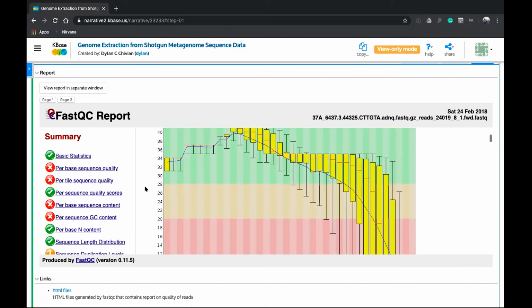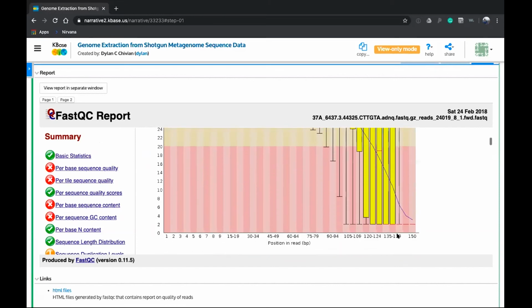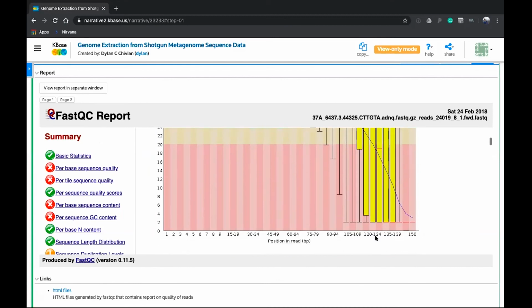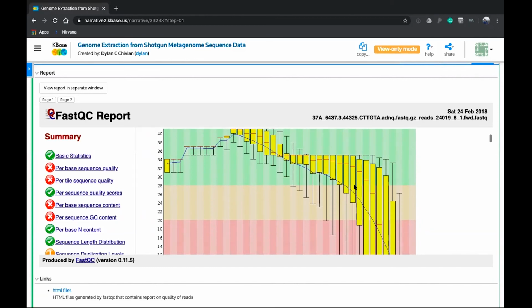But some of the nice things that FastQC provides that our KBase auto importer doesn't handle is it produces these nice maps of your read library quality in the form of highlighting positions in your reads where the quality starts to flag. So, in short, this is a tool that allows you to sense where you want to quality control your data for downstream processing purposes.